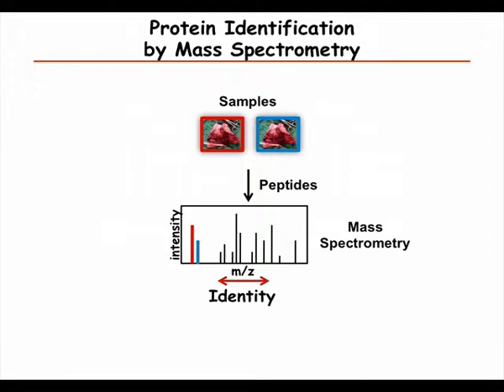But in a fragment mass spectrum we still don't know if the charge is on the N-terminus or the C-terminus for that peak. So we always have this ambiguity of whether it's a B or a Y ion that we need to resolve. The other problem is that we don't get fragmentation between each pair of amino acids in a peptide, so we also have missing information.